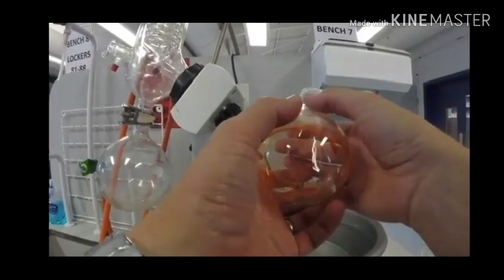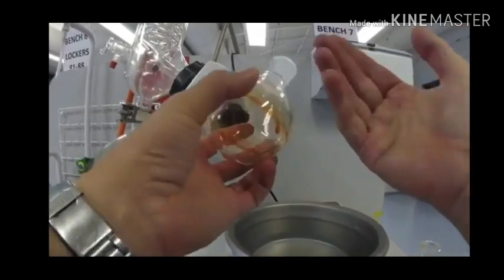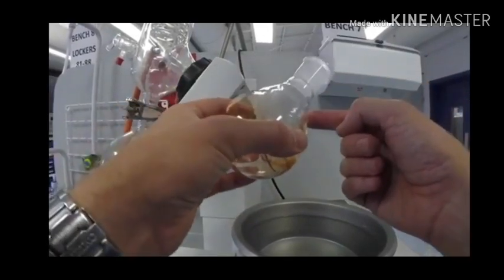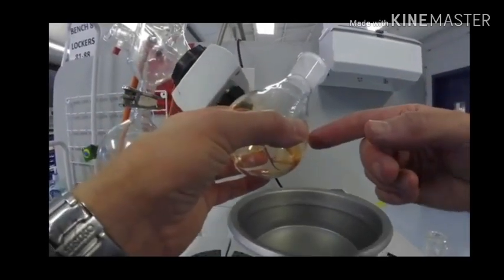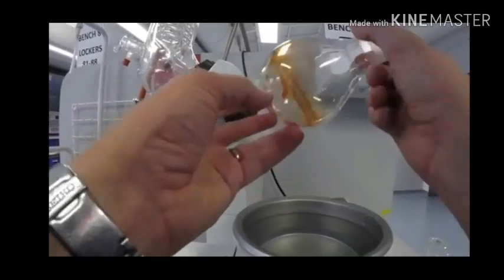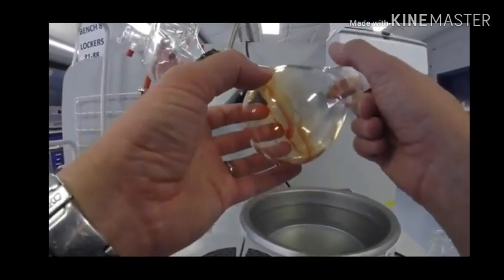One very important thing to remember is that if you are preparing a sample, is to weigh the flask before you put anything into it. And that means you can weigh the flask again afterwards, and you can get the weight of the solid that's in your flask.